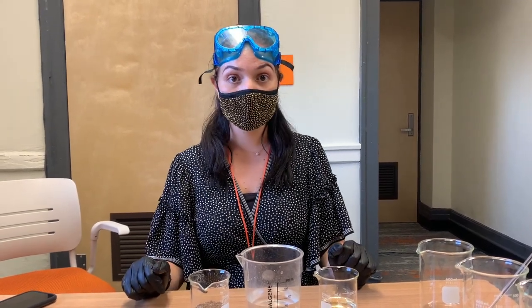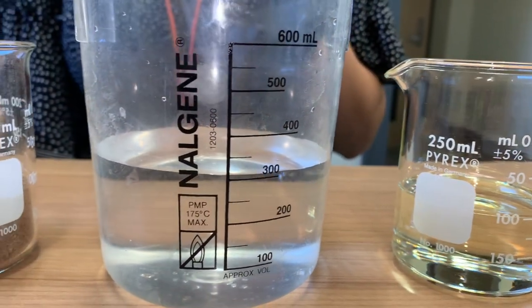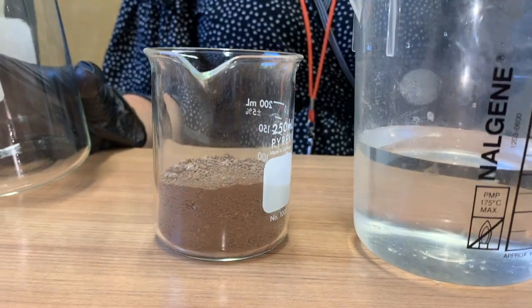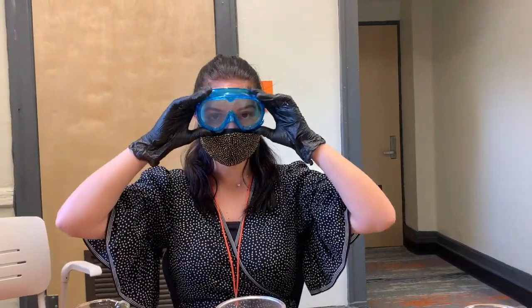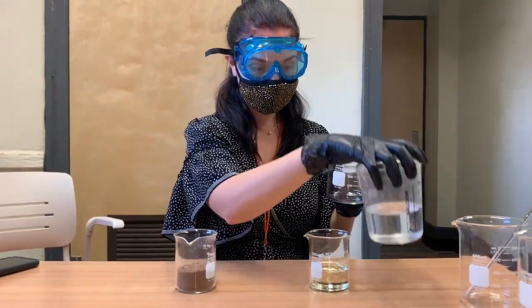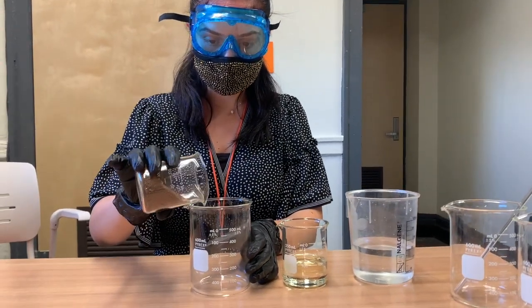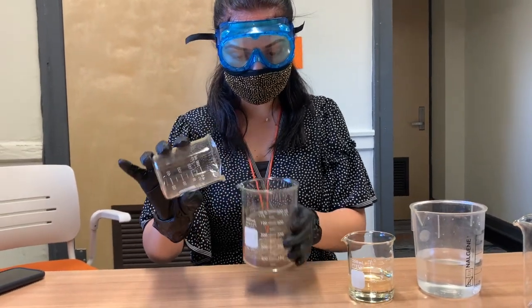So first what we're going to do, we're going to take this empty beaker and we're going to pour dirt, water, and then oil into the beaker. And then, following the decantation process, we're also going to be separating them from each other. So let's get started. So first, I'm going to pour in the dirt. Get it nice and even.